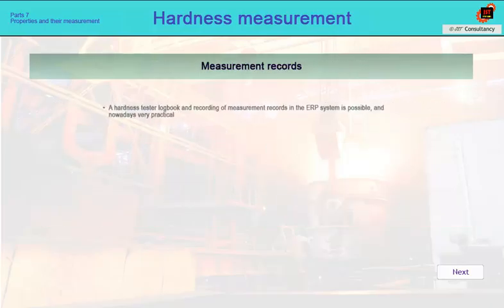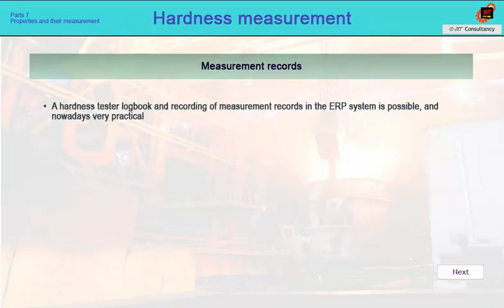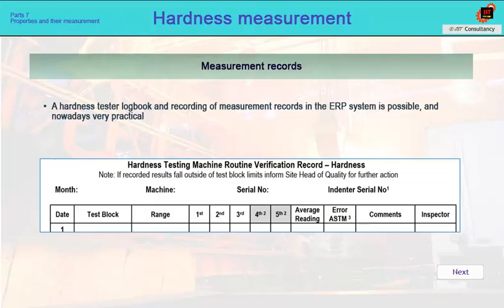Although hardness measurement is a seemingly simple discipline, it is actually very demanding with regard to the need to ensure reproducibility and traceability of measurements. Each instrument should have its own calibration record and traceability to higher standards. The hardness measuring instrument should also include a hardness tester logbook, which contains records of daily or shift calibration, maintenance of the hardness tester, or replacement of the indenter or weight.